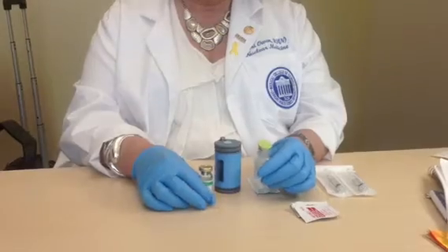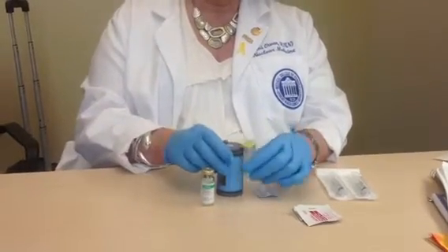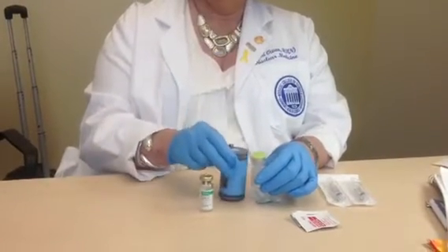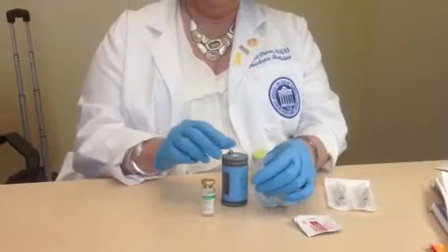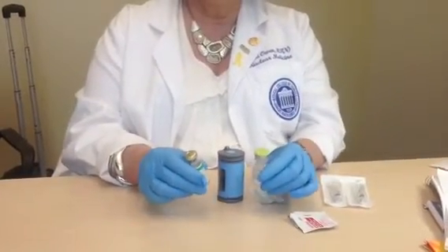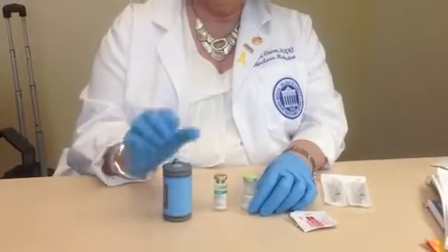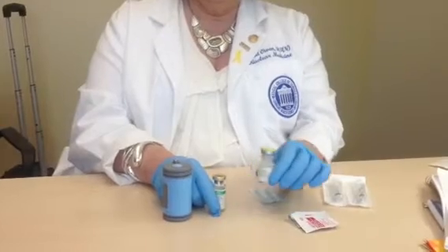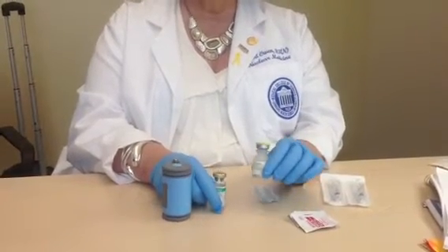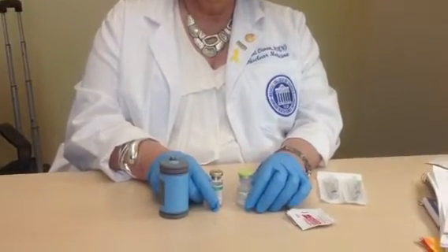that has bulk technetium dose in it. Under normal circumstances it would be radioactive, and it would reside in a lead-shielded vial container like this. But for the purposes of your ability to see what's going on, we're going to do this unshielded. So what we have is bulk technetium, and this could be anywhere from maybe 50 to 100 millicuries, as it would have come from the central pharmacy, Radiopharmacy.